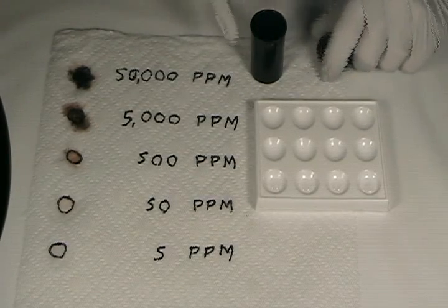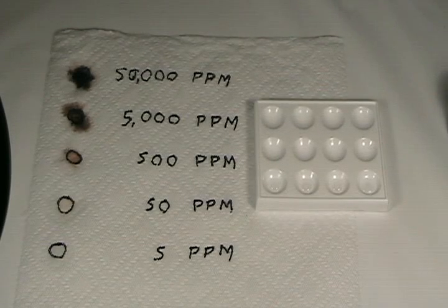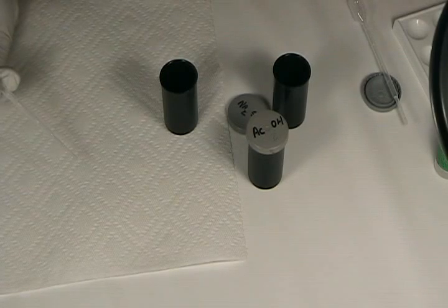If we allow these to sit and continue to react after a period of several minutes, the colors will deepen. The 50 parts per million spot is probably visible on the video now, showing a tan color, and eventually the 5 parts per million may show a color. Now that we've tested the sensitivity of our sulfide reagent with different concentrations of lead, it's time to do some actual paint testing.